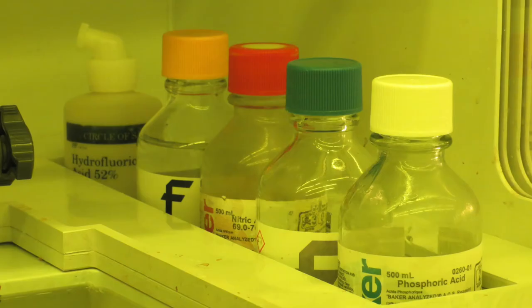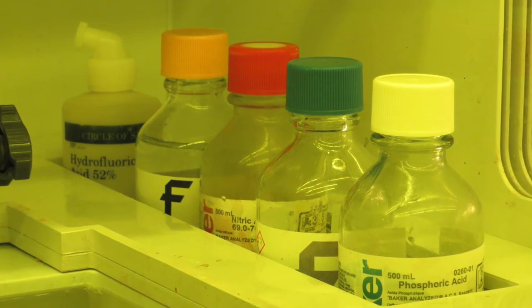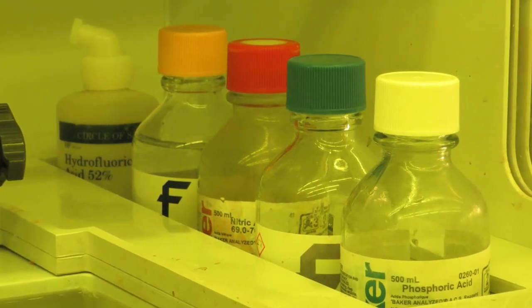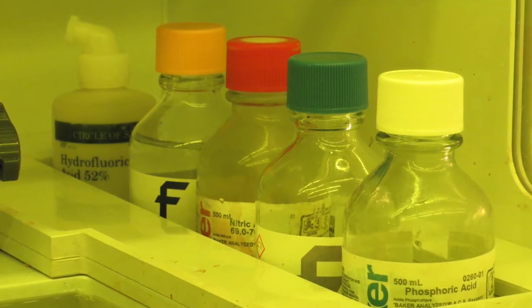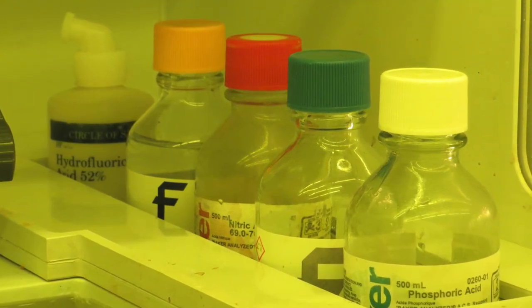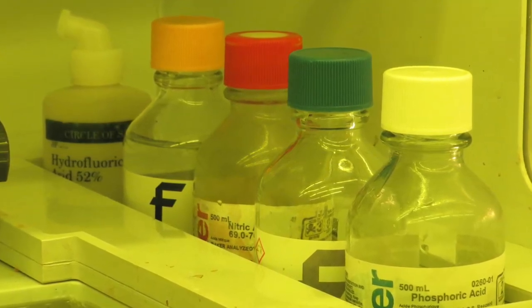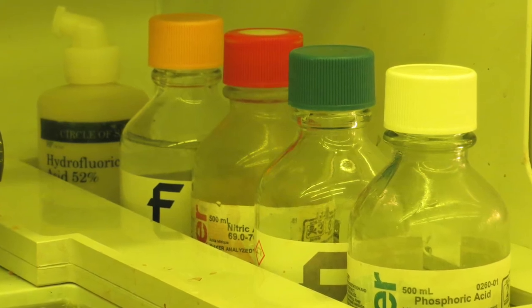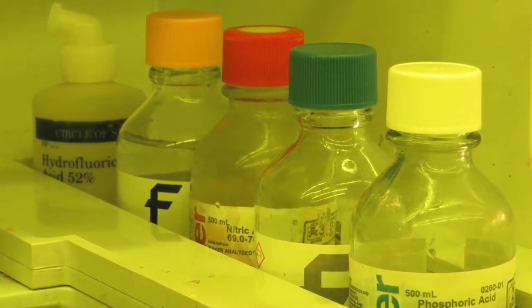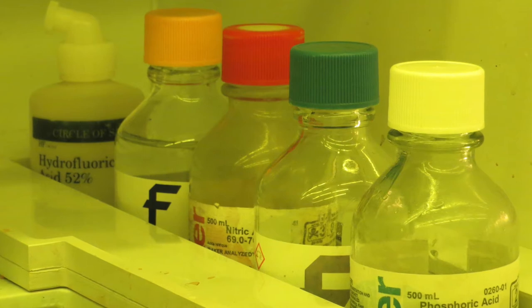We provide many of the common acids such as phosphoric acid, hydrochloric acid, nitric acid, sulfuric acid, hydrofluoric acid, as well as some common etchants such as BOE, chromium etchant, gold etchant, which are stored in the rollout drawers below.